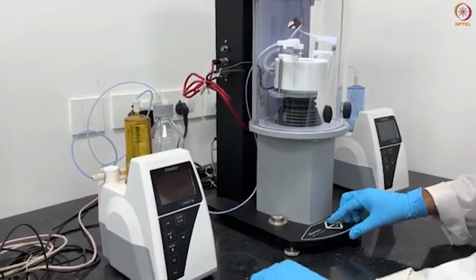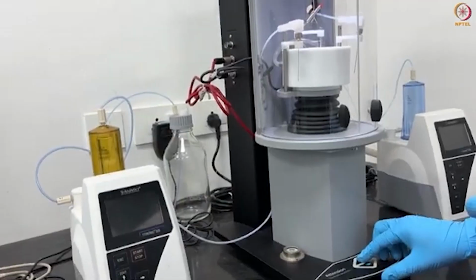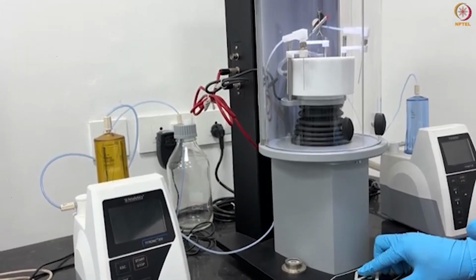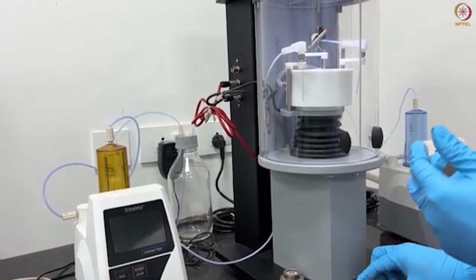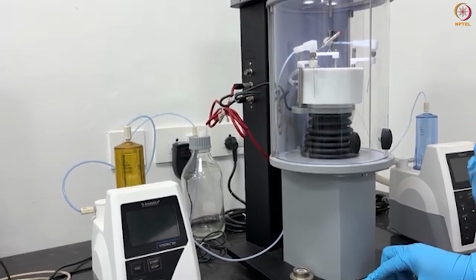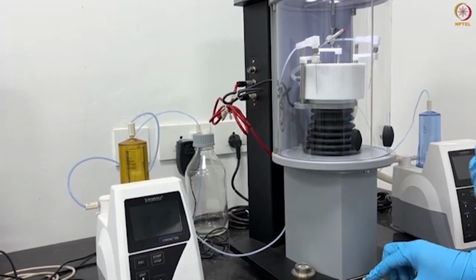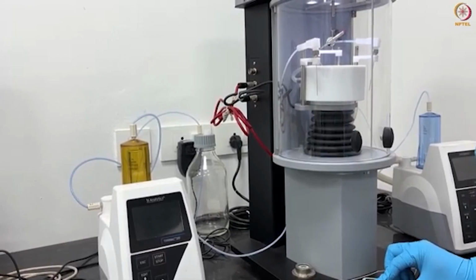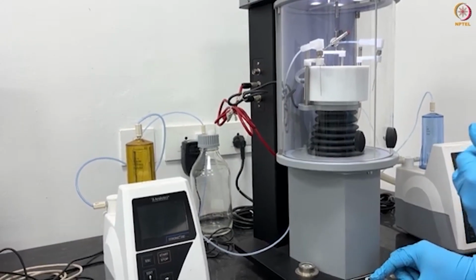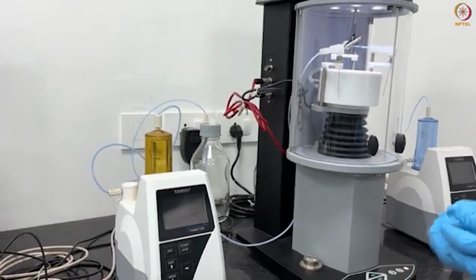Now we need to lift the stage up so that the ring is nearer the surface. As I move the stage, you will need to determine manually if the system is close enough to the surface. Once the position is set near the surface, it will become 0 and the balance of the Du Noüy ring attached to the weighing system will also hit 0. This zeroing process is performed using software which you will handle shortly. Let us now move the stage closer to the surface.